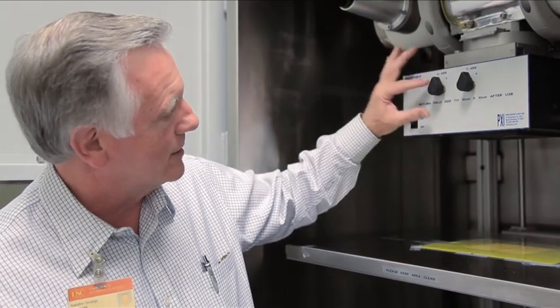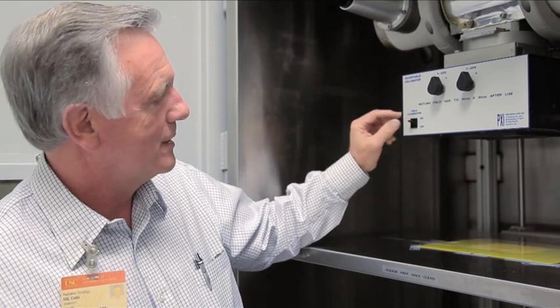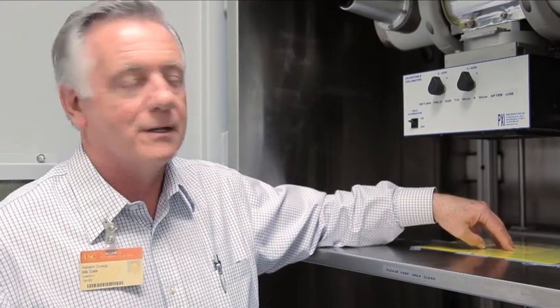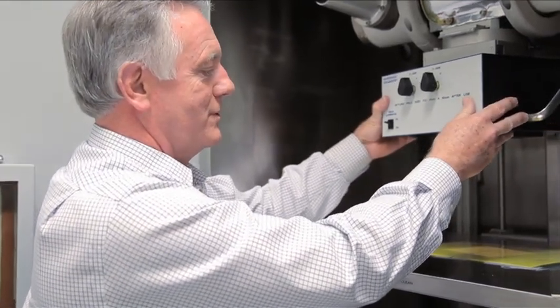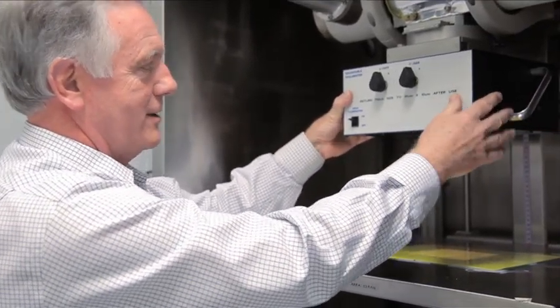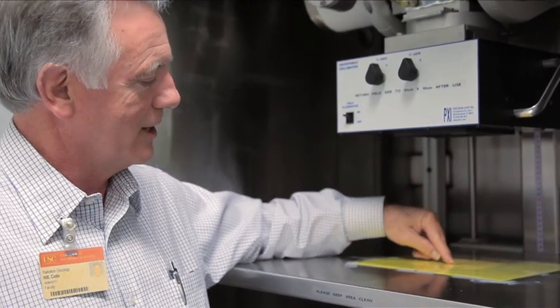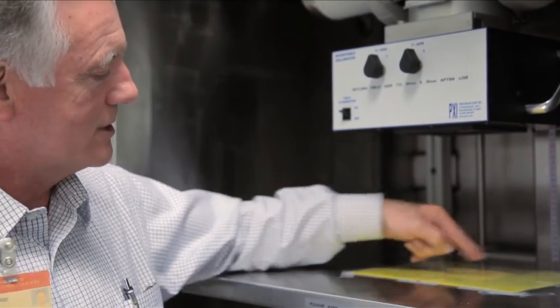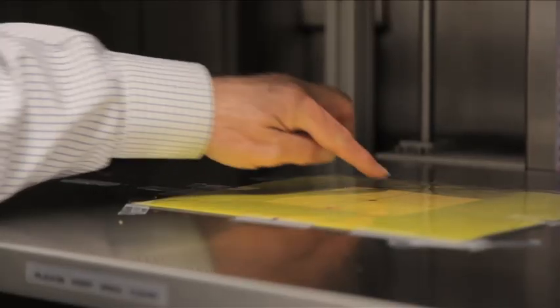This is the collimator that adjusts the field size. This is the switch that turns the light on and off. Generally, we leave the light on so you can see that you're actually in the field under radiation. The collimator can be moved and it's a good idea to check that it's centered. There is a plate here that shows a little X. The collimator has a crosshair and you can tell that the whole thing is properly square by matching the crosshairs with the X.